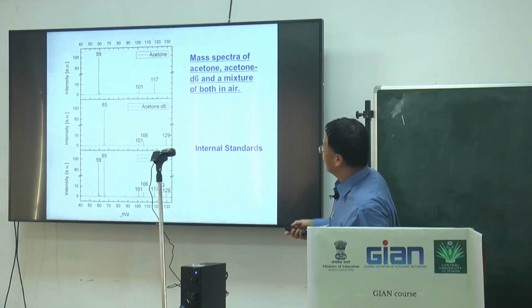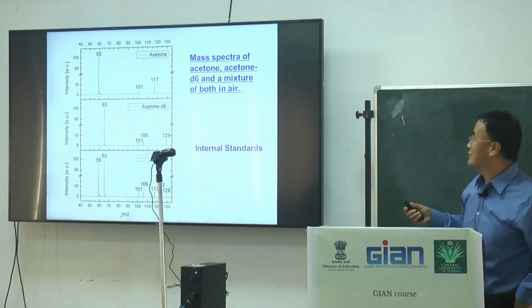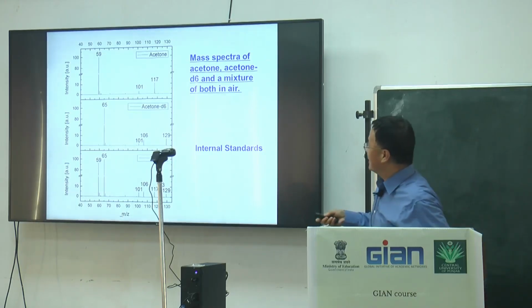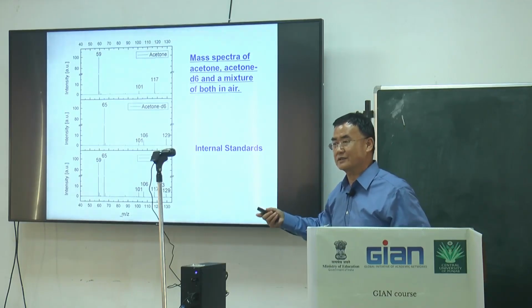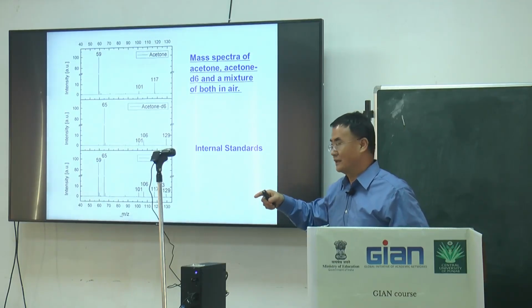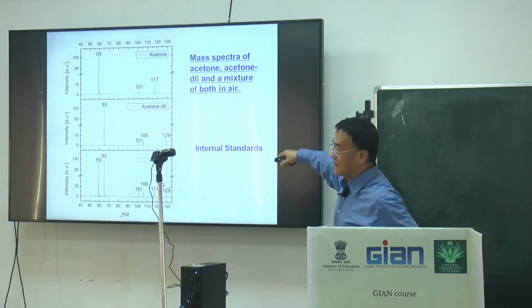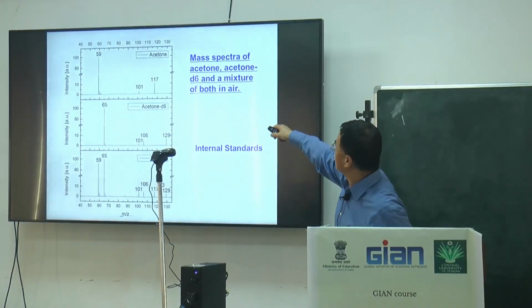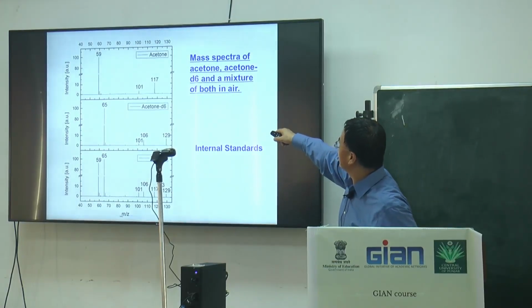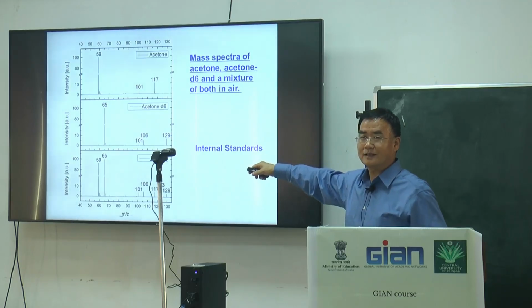This is used during quantitative or qualitative analysis to determine structure or the metabolite formula. One option is an internal standard, or using other heavy labels, like D6, heavy water.